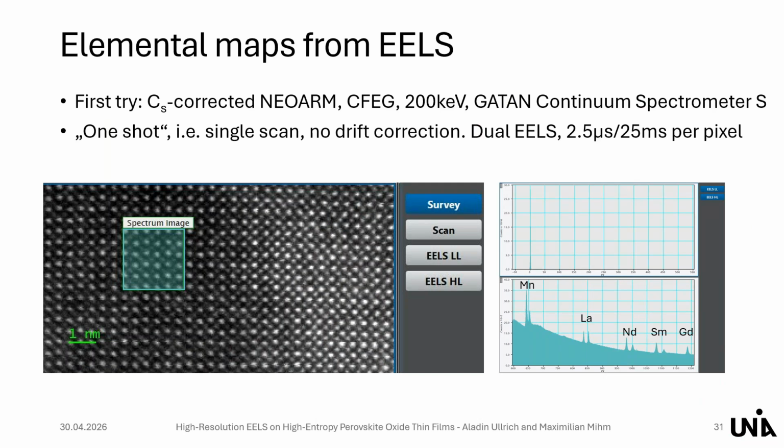So this is what you saw, but there are many ways to make sure that you are able to do the maps even for the edges where we do not have very sharp onsets, like M edges and N edges.